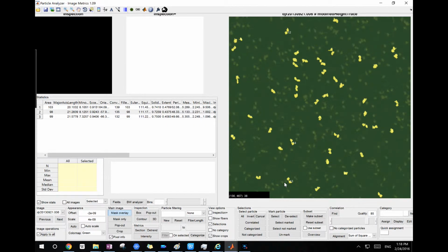Now we have a lot more results. We want to start from a small number of results first, because it's easier for the system responsiveness. It's also easier for us to manually refine this matching process, because the computer does not always give you the best results. You have to go through a manual review session. So you don't want to have a lot of particles for now. It's always easier to start with a small number of matches.